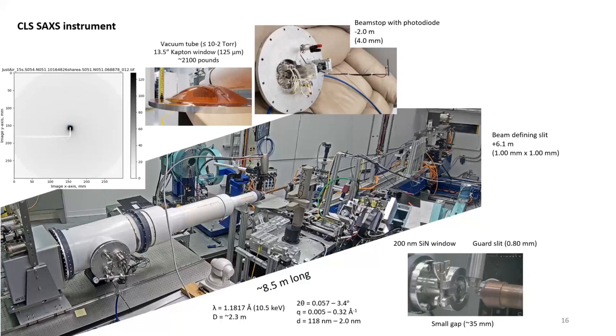Oh, that sounds challenging. Maybe through modeling you could pull it out. I don't have the answer, but I think the pair distribution will allow you to determine: is it core-shell or is it spherical? Is it actually a two-phase system? I think you've already got partway there. I've seen some core-shell tools for modeling inside Irena and Nika. They're probably elsewhere too, but Irena and Nika has that one.